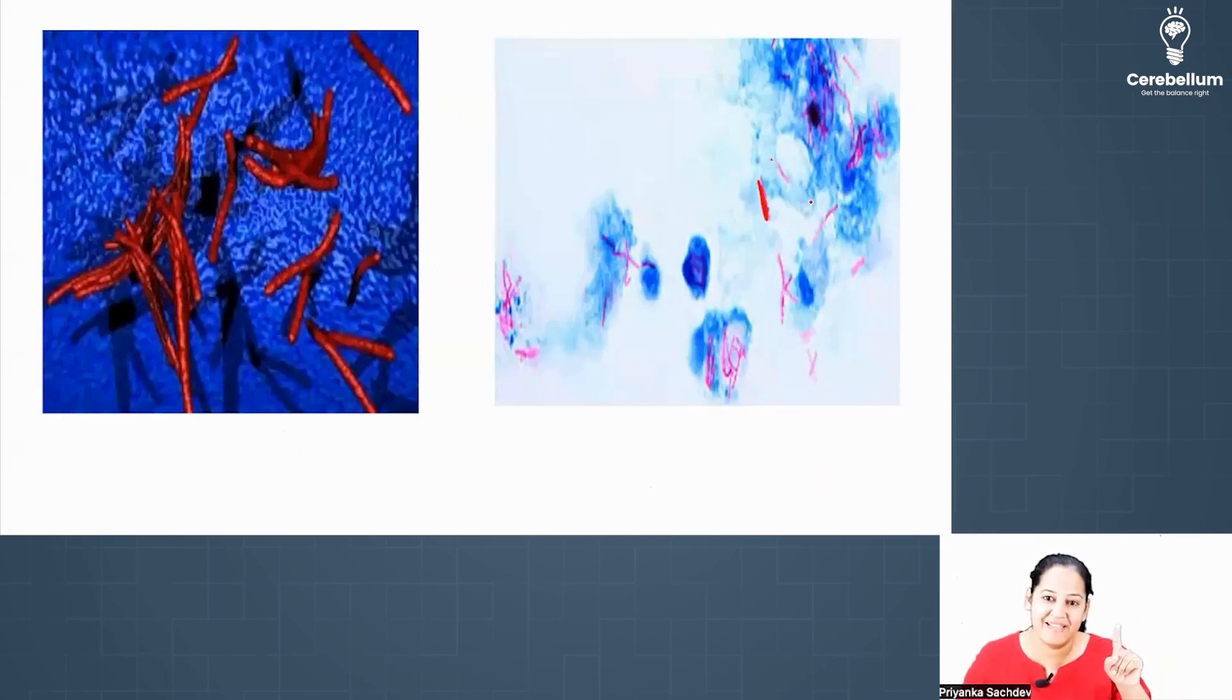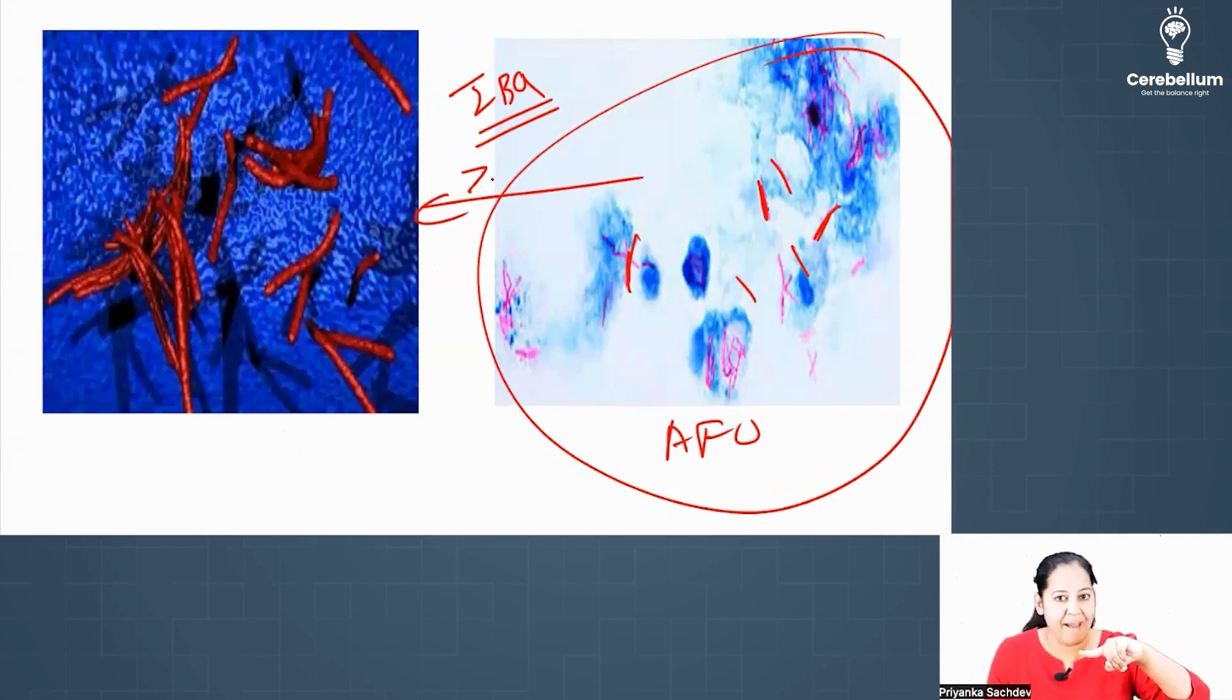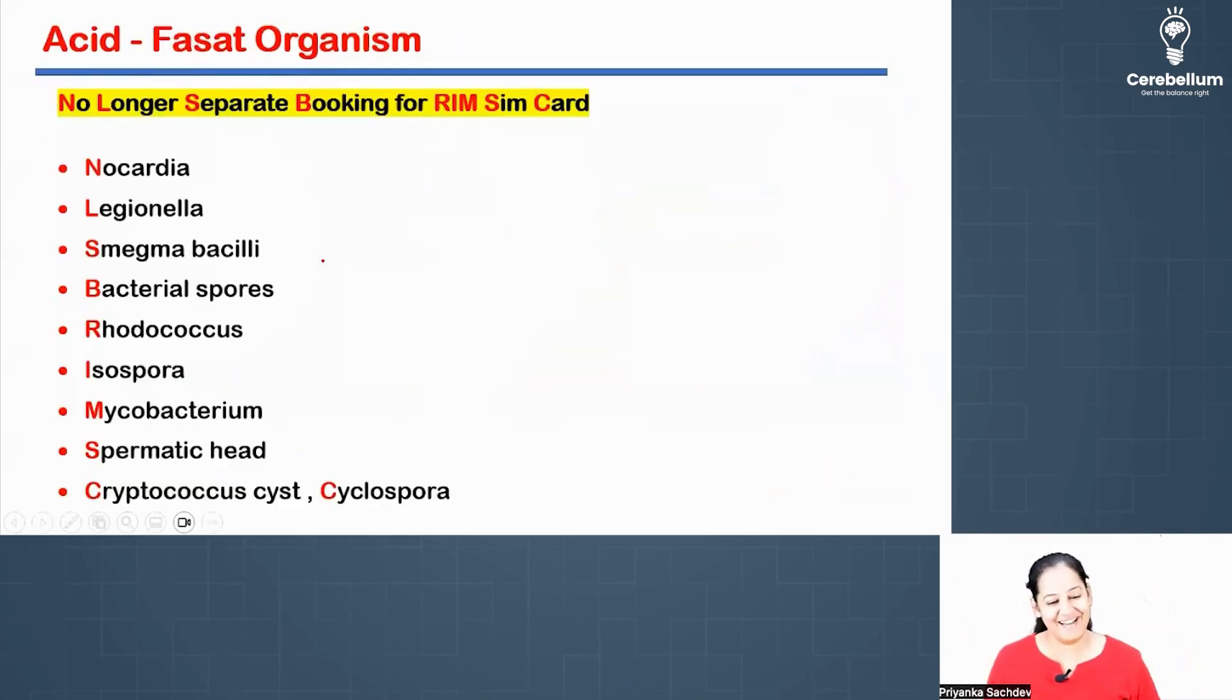You can see the red bacteria, it's an image-based PYQ in your exams, NEET PG. See the red bacteria on a blue background. You say, ma'am it's AFO because the red bacteria on a blue background, it's AFO. See, this is the magnified version. Another red bacteria on a blue background, the red bacteria on a blue background. Got it?